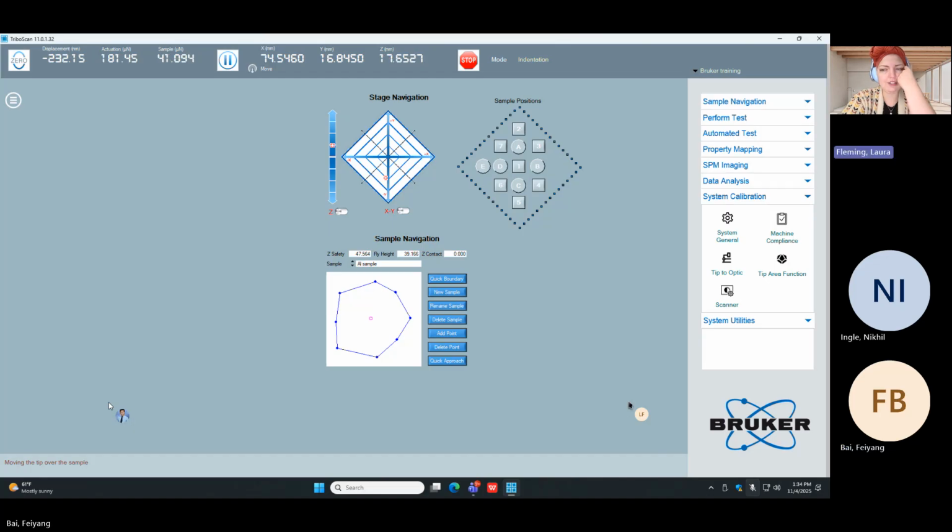Was there also a question? Not a question, more like when we finish the training, I like to have a standard operation manual. I think that we're going to draft one. If you can help us take a look. Oh, I would be more than happy to do that. Yes. If you guys want to draft one up and send it over to me for review, I'd be happy to do so. Thank you.